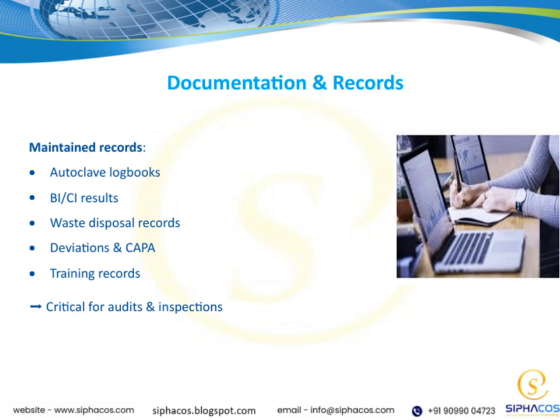Waste disposal records show that we're managing waste safely and in compliance with regulations. Deviations and CAPA records document any issues that arise and the corrective actions taken to address them. And lastly, training records verify that staff are properly trained and qualified for their roles.